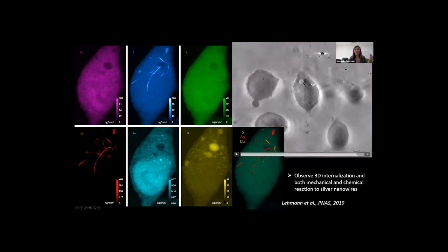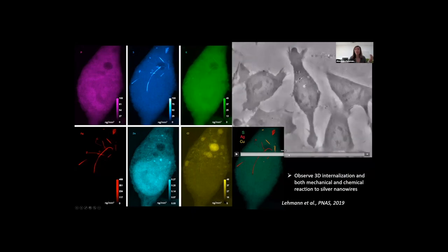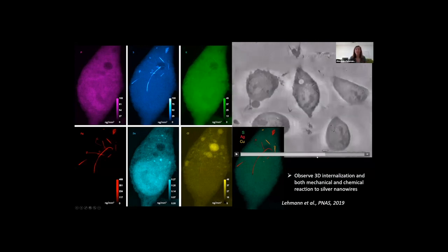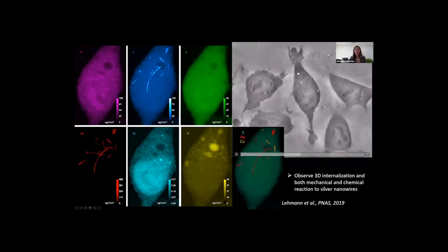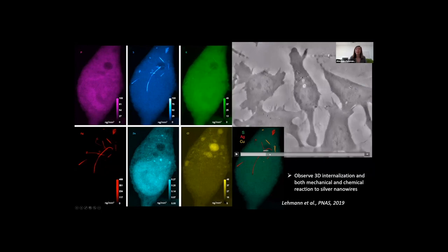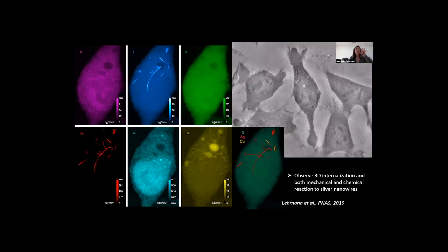So here, what you see are images of the cells with phase contrast. The contrast is not great, but consider this is hard X-rays. It's actually quite good. There is absolutely no attenuation contrast. It's all phase contrast. And this allowed us to see these small and slender dark structures, which are the nanowires. So we could see that they indeed penetrate inside, and also that the cells actually have sufficient mechanical force to bend them and fold them together and encapsulate them in what I think are endosomes, in order to try to defend themselves.